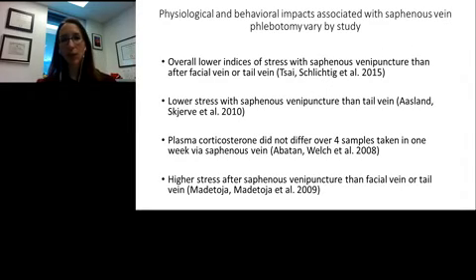So again, this goes back to what we talked about with some of the difficulties in comparing these techniques. This really may depend on whether or not the animals were restrained a certain way, how long it took to do the procedure, and whether or not there was any particular preparation of the site. There are other reports that also evaluate the saphenous vein, but I wanted to make sure that you were aware that the impact of saphenous vein depends on what paper you read.